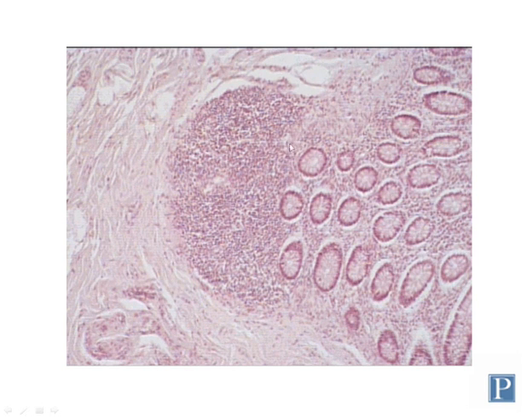But if you look carefully in the spaces between the epithelial glandular tissue here, you can see dark nuclei of lymphocytes throughout this region as well. And these more diffusely arranged lymphocytes are actually T lymphocytes. Under a light microscope with this particular stain, they are indistinguishable, so you just really need to know them by location. B lymphocytes are always aggregated together, frequently as these nodular type structures, whereas T lymphocytes are often more diffusely arranged.